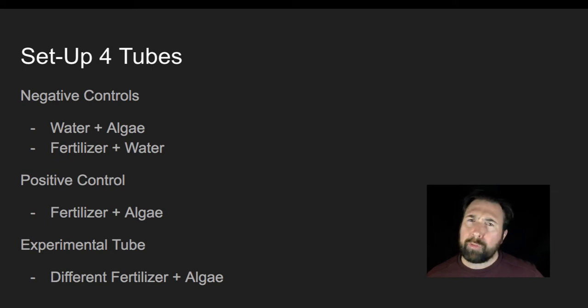Does the algae grow on its own if you don't add fertilizer? Well, the answer is possibly. How are you going to know how much that is? Well, you set up this tube in order to determine it. Does the concentration of fertilizer change over time, or does the turbidity of something that has fertilizer in it change over time? We don't know. And so a control will allow us to account for any changes that will happen to the fertilizer concentration over time.